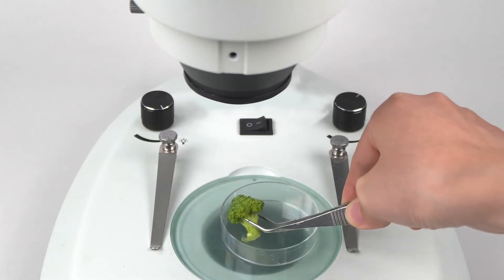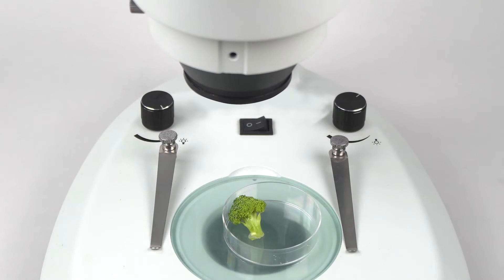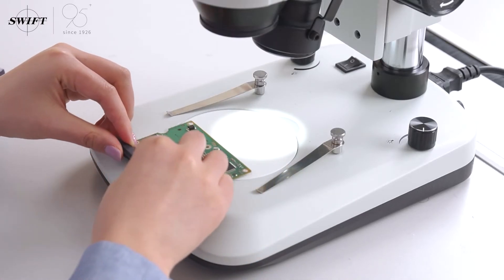This model can observe tiny organisms such as animals and plants and can also be used for industrial product testing.